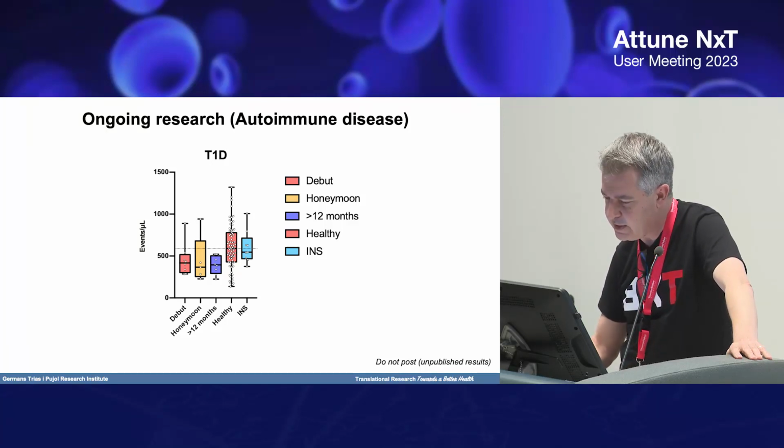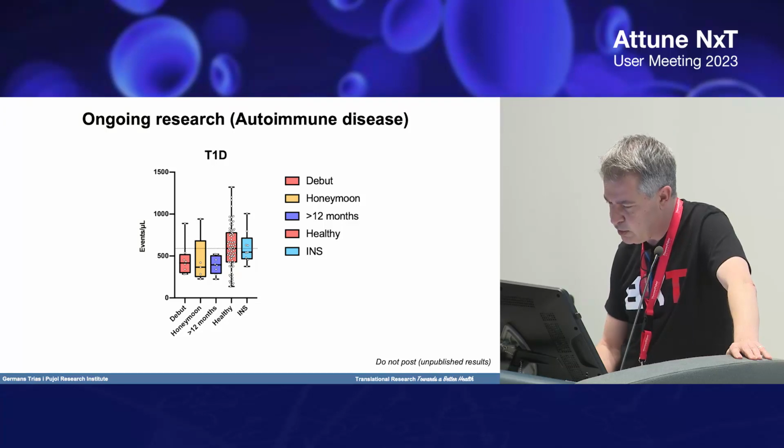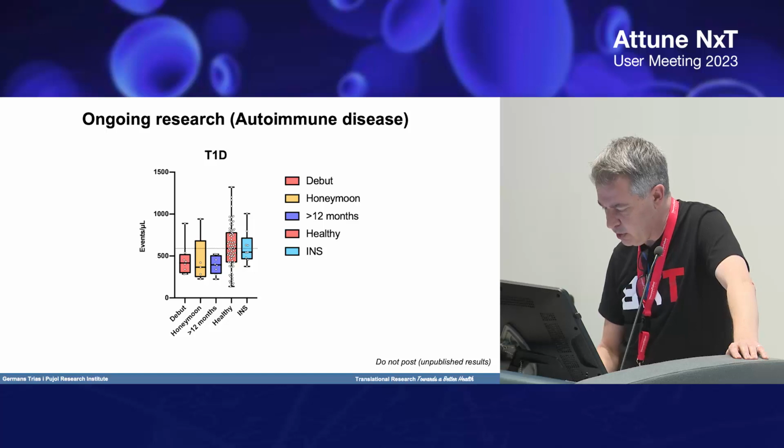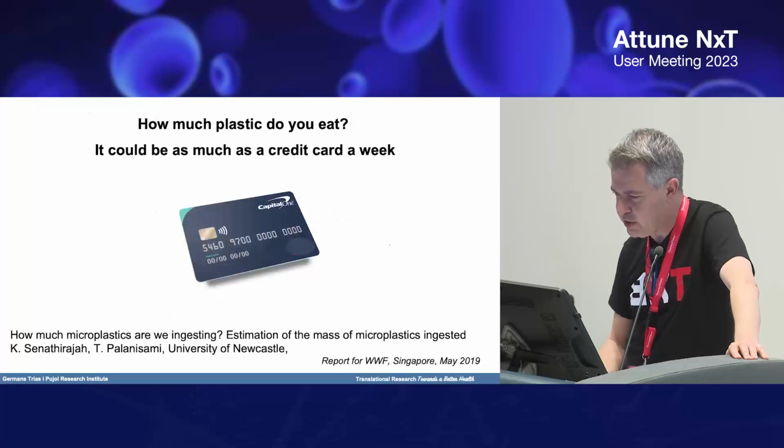We are currently investigating this plastic accumulation in type 1 diabetes, and we would like to extend this experiment shortly to multiple sclerosis patients.